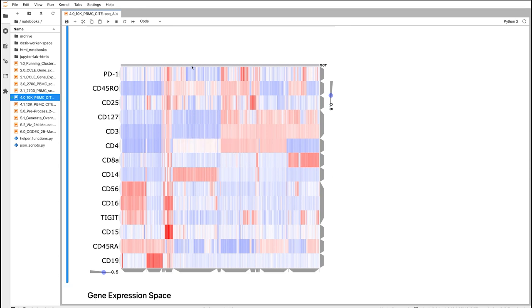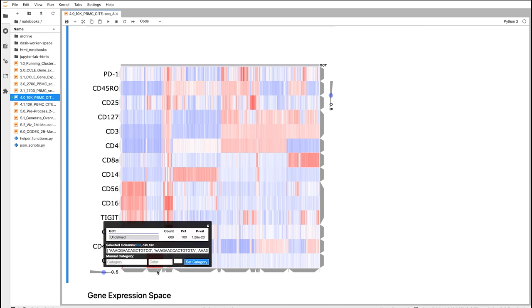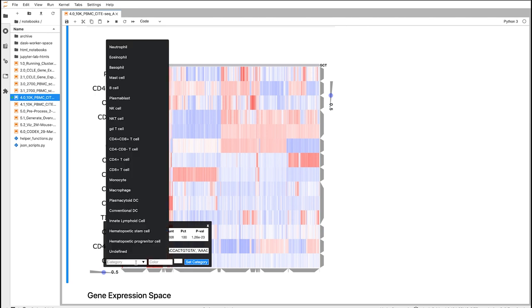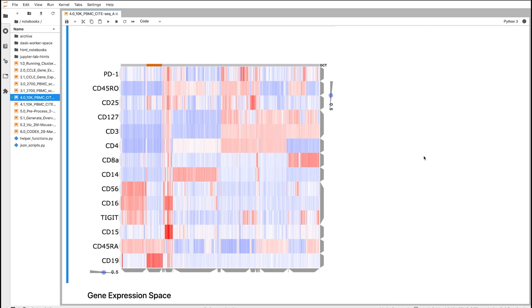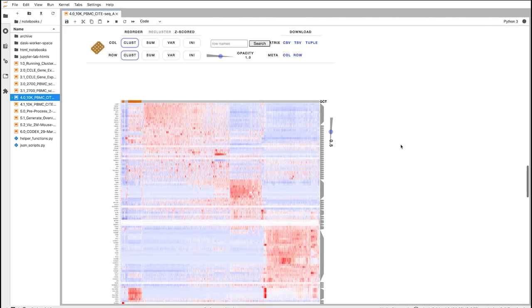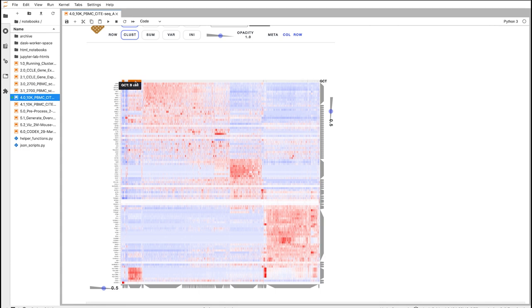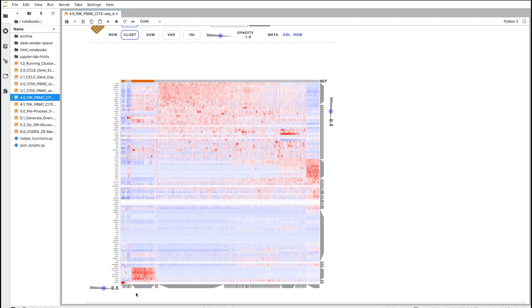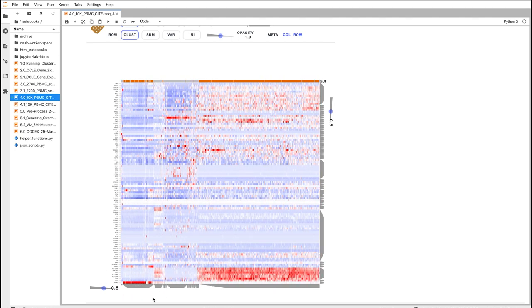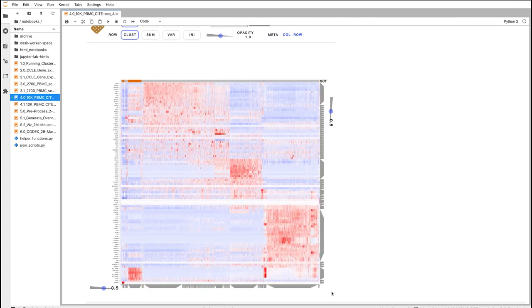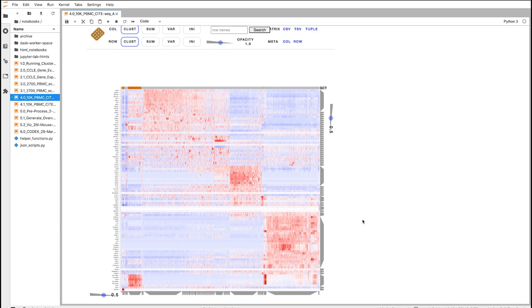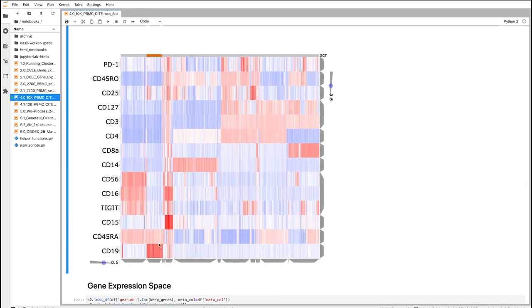We start off with everything unlabeled as unidentified, but we can go through and start to identify some cell types. We can say CD19-high cells here, go through and type in B cell, click B cell, and we've labeled our B cells. What's really nice about the widgets framework is you can link things together — that labeling has transferred to this other widget. Now we can see here are the same B cells, but here they are in a different space, the gene expression space. We can find different subsets within that space — this subset has a particular gene highly expressed, and in this much higher-dimensional space we can find relationships we may not find in the protein space.